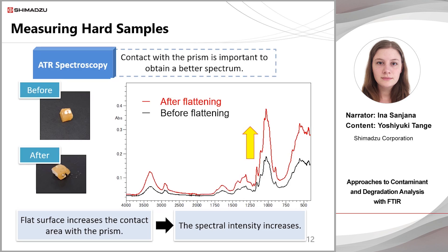Two spectra are shown here, before and after flattening. Compared to the spectrum before flattening in black, the spectrum in red demonstrates that contact between the sample and prism was improved by flattening. The contact area with the prism has increased and with it the intensity of the spectrum. If the intensity of the spectrum is high, small peaks can be observed and the influence of noise is relatively small, so the overall accuracy of qualitative analysis is improved.